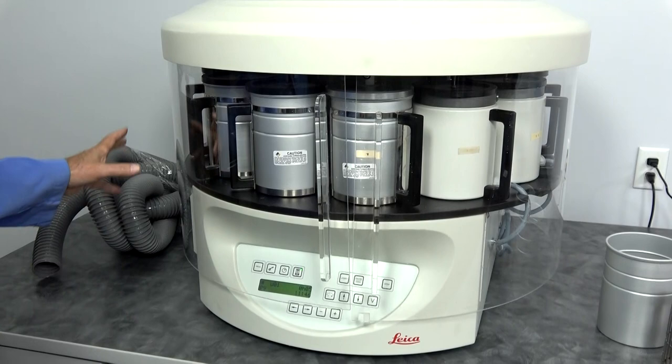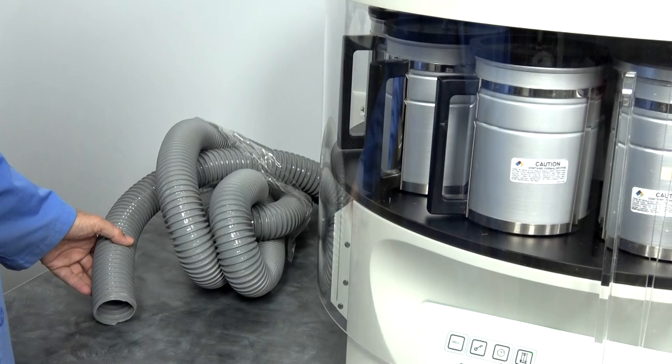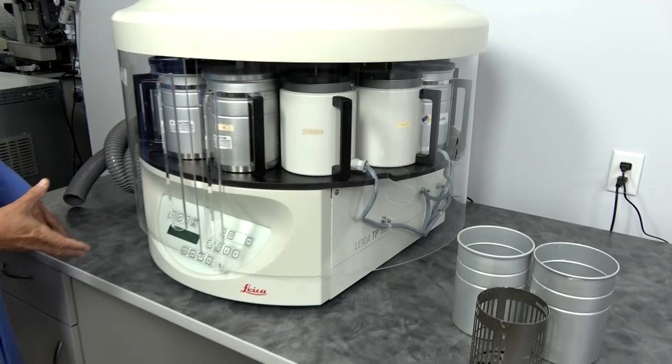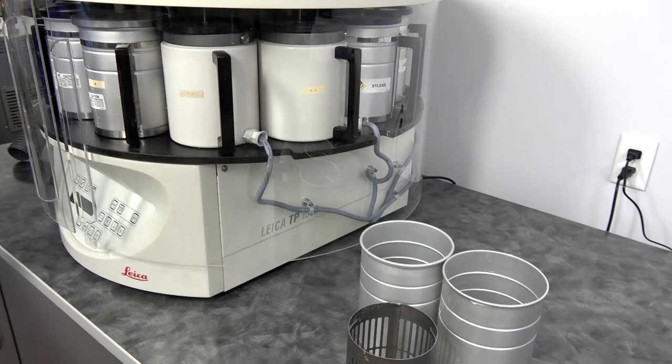There are a lot of different options available with the unit, from fume extraction, which is this hose that we hooked here. You can run that down to your fume hoods. Also, this particular model has a vacuum option installed, and you can get additional wax reservoirs. Also, you can get it so that it can run 2 baskets at one time.